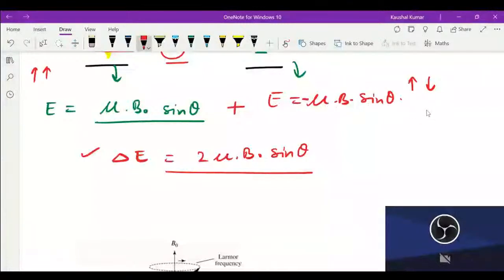So do you have to remember all these formulas? No, never. Not required. You don't have to remember these formulas. Nobody will ask you. We are seeing the concept of this. So after seeing this, you have to find the frequency. This is the important thing. Then only you will read.